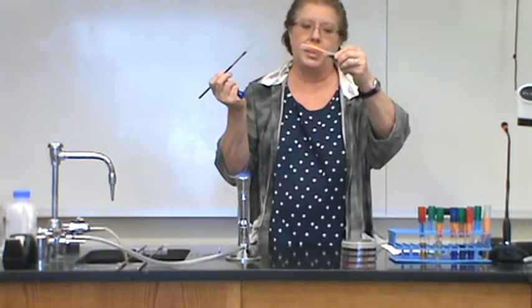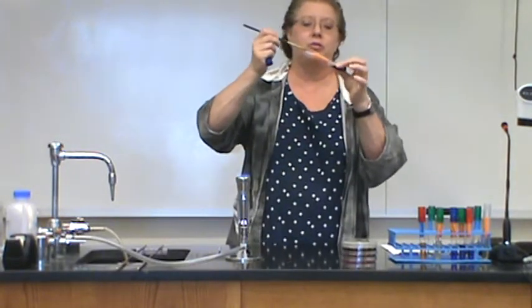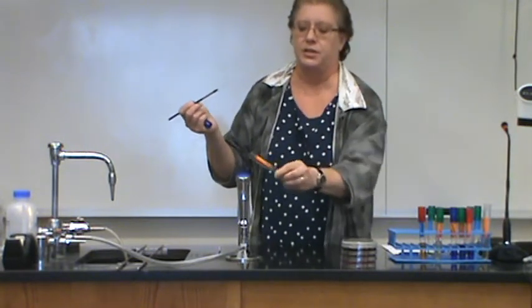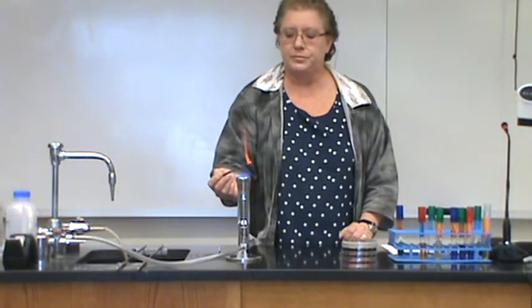Remember to keep the agar horizontal, it's easier for you to work with. Flame the top, go in with that loop, and like you learned in aseptic technique, just go along the surface of the agar, just going back and forth and kind of zigzag. Okay, so you have inoculated the surface of the agar now. Flame the top, put the lid on, and then flame your loop. Okay? Then you can set that down.